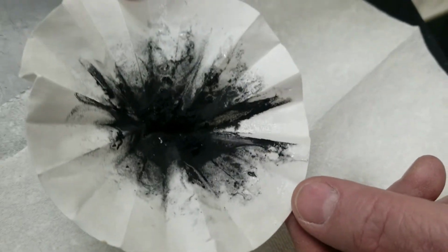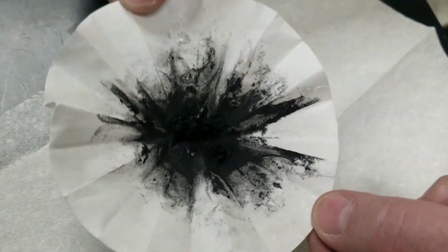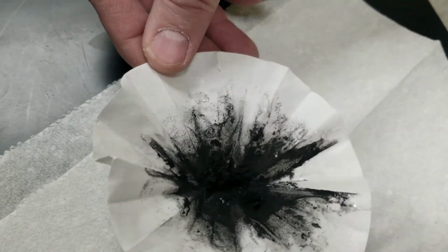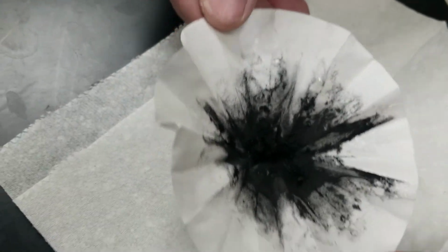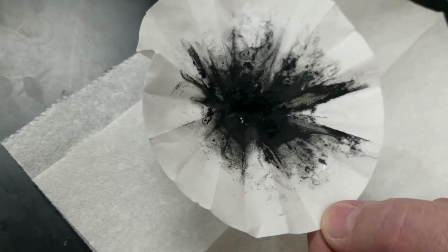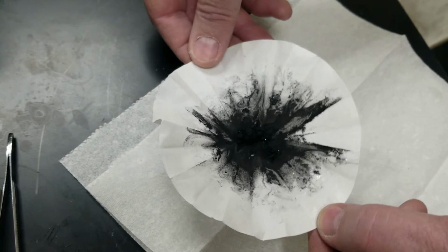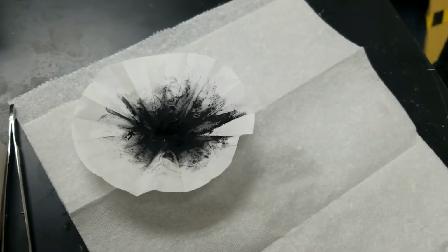It's really hard to see when the paper is wet because the sparkles just dissolve into the water. But there's a little bit, but it won't weigh more than maybe a tenth of a mil, or maybe 1 or 2 milligrams. Acetanilide is very lightweight, but we did pretty good. Now we're going to filter our final product.